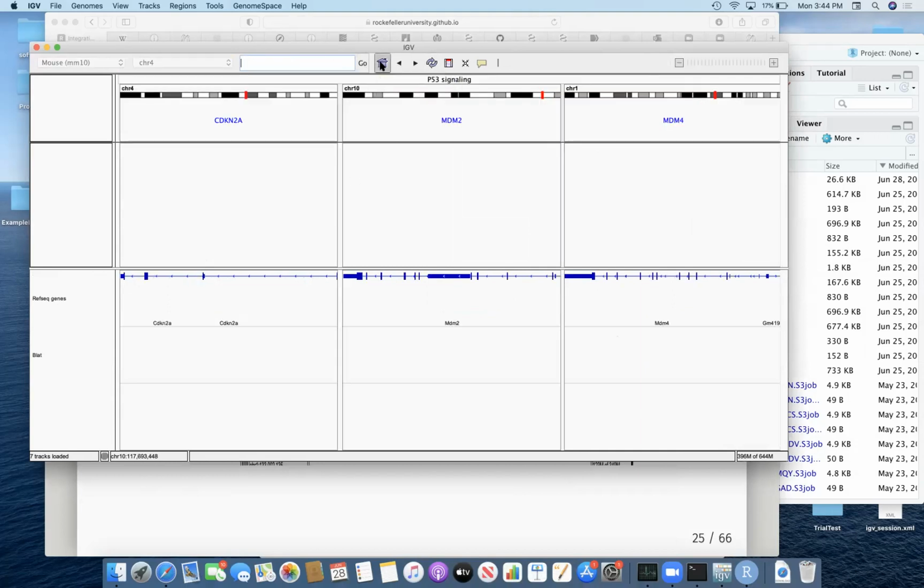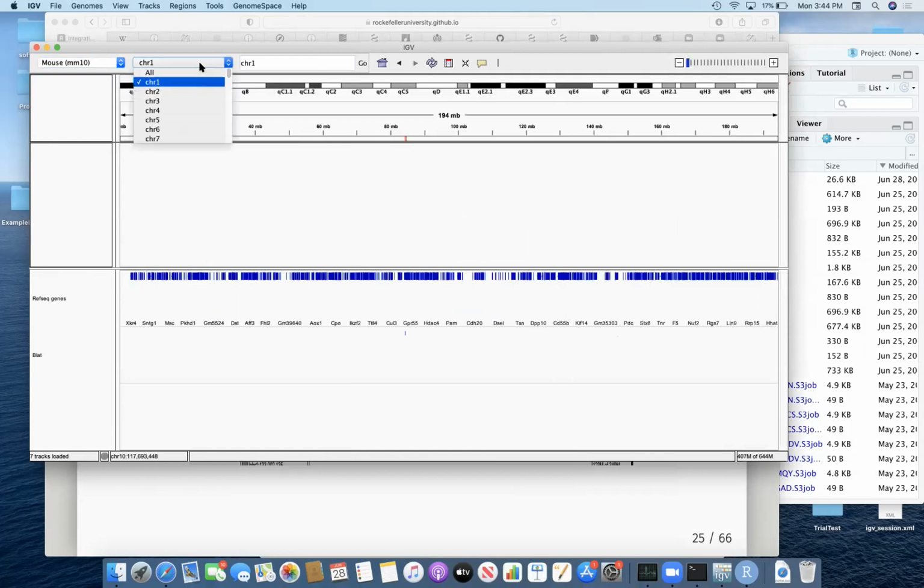If I want to escape this, I can just press home. Oh, it didn't work, that's fine. Maybe I click here. Oh, wait, now I've frozen IGV. Try that, now I'm back. Okay.